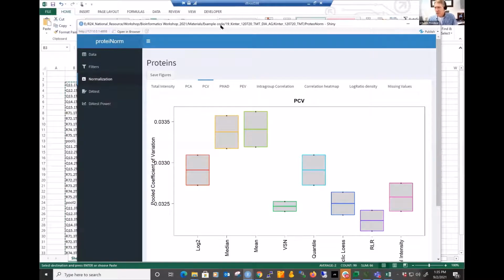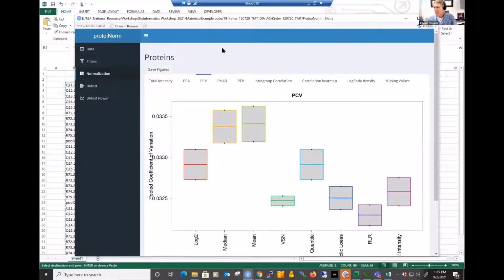So let's go to. Hey, Stephanie, can I jump in here for just a second? While you're talking about normalization, there's a question that came up from Gazelle. It says, can we compare the protein intensities coming from 2 different instruments? Are there special normalization techniques to do that, or do we always take the intensities coming from the same experiment only?